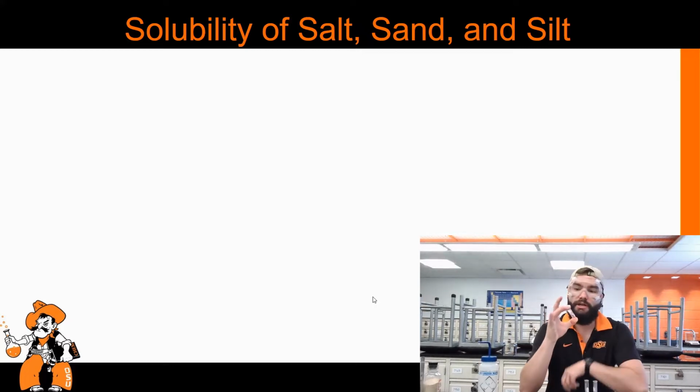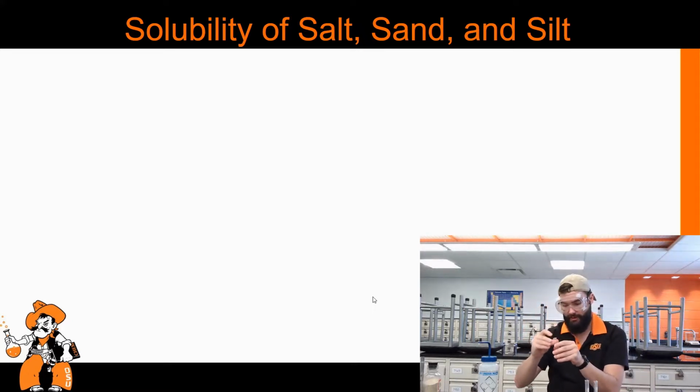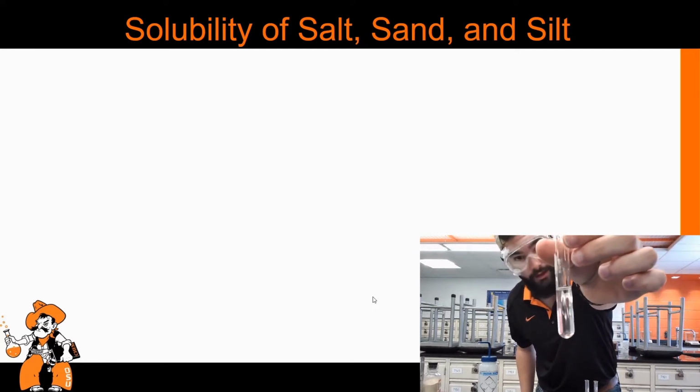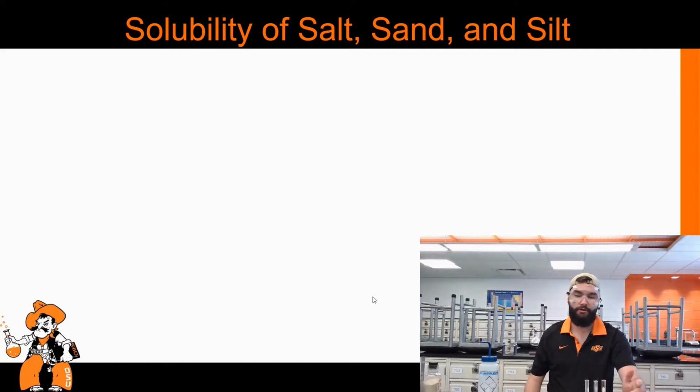Give them all a good shake. This was the test tube that I had my salt in. Okay? So the salt has completely dissolved. So salt is soluble in water.